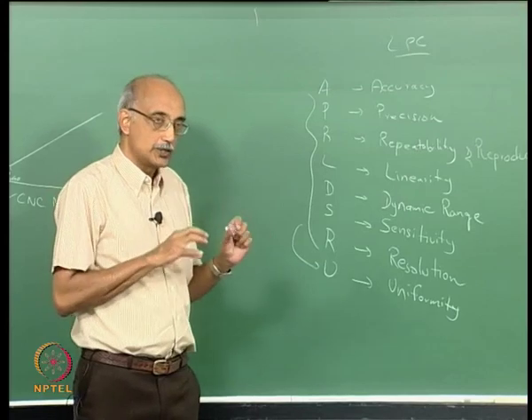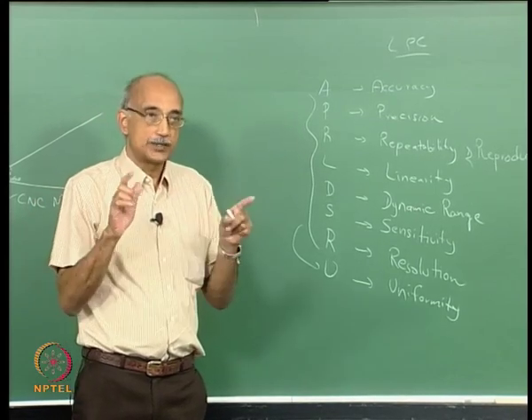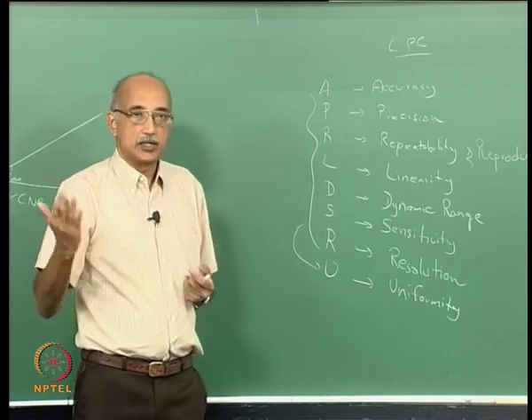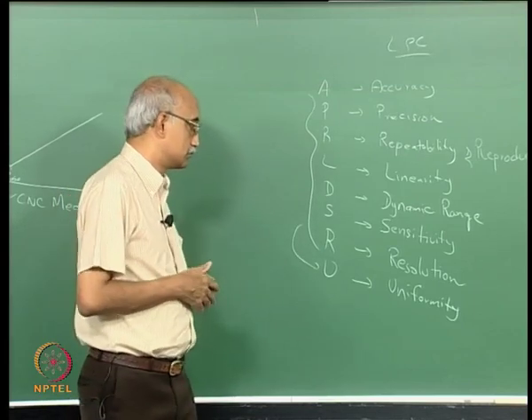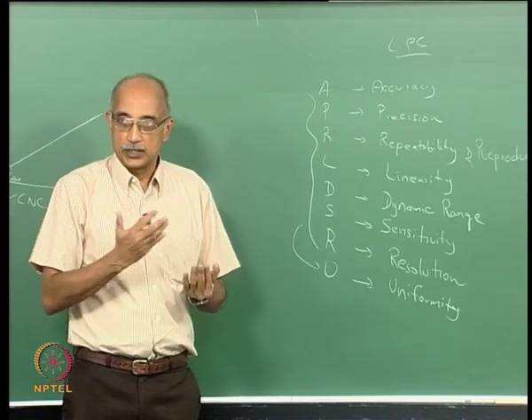The microscope that you use will be different, and even the filter that you use to collect the particles will be different depending on the size range that you're interested in. For example, if your sample only has particles that are, let's say, 100 microns and larger, then you can actually use a fairly coarse membrane filter and use an optical microscope as your absolute standard to do the calibration against.